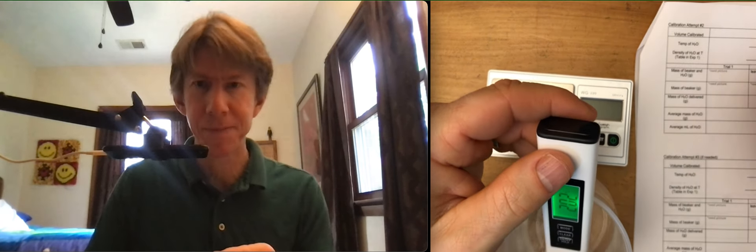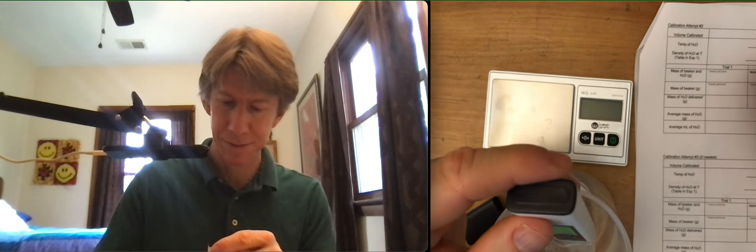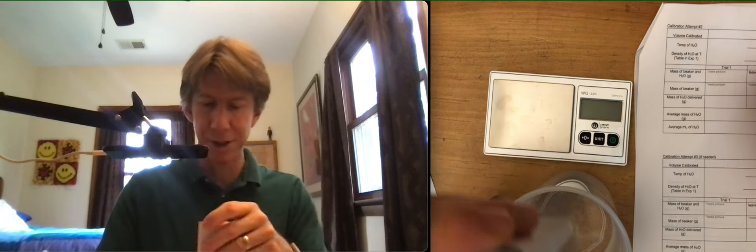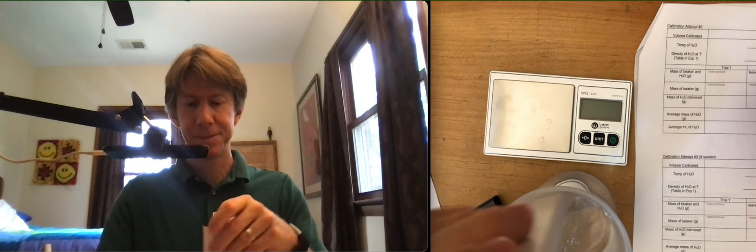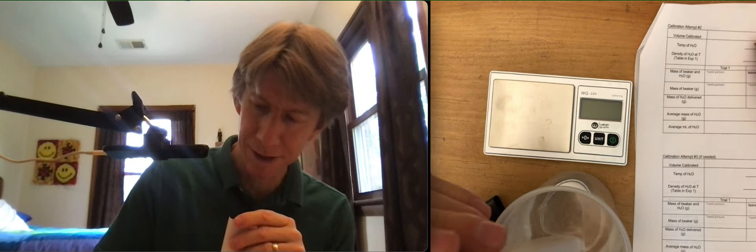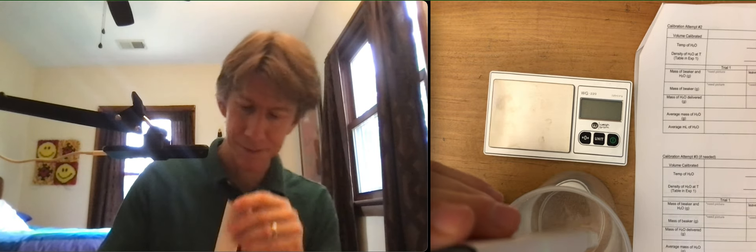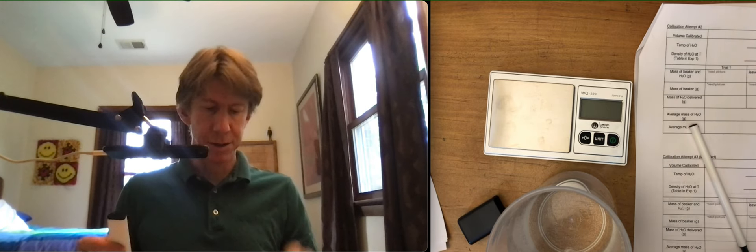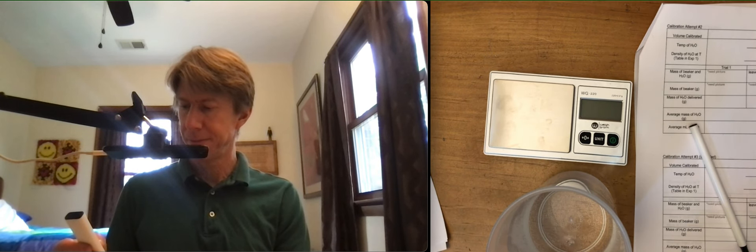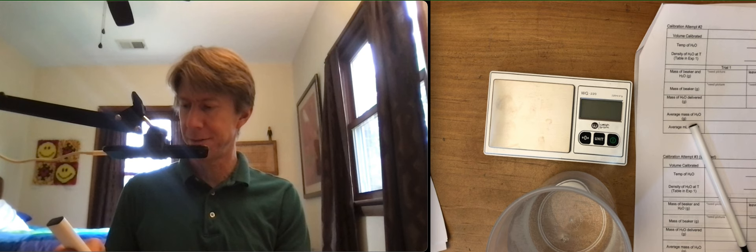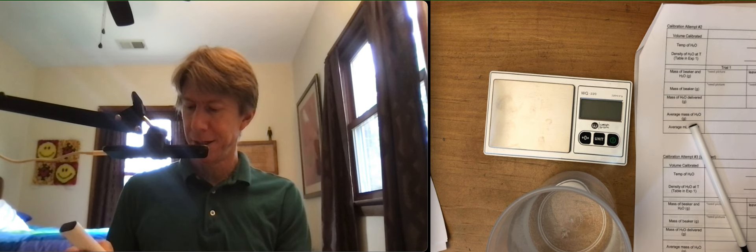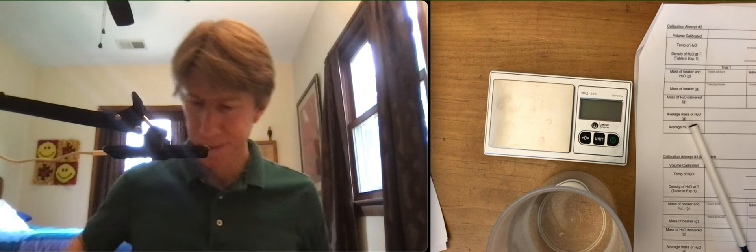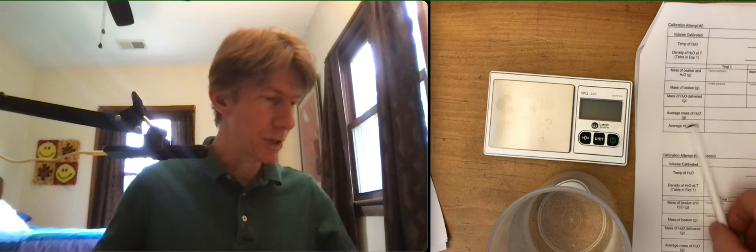But now it's going down really slowly. And when it goes down really slowly, it means that you're basically at equilibrium. Can you read that? 20.2. 20.1. 20.1 it is.